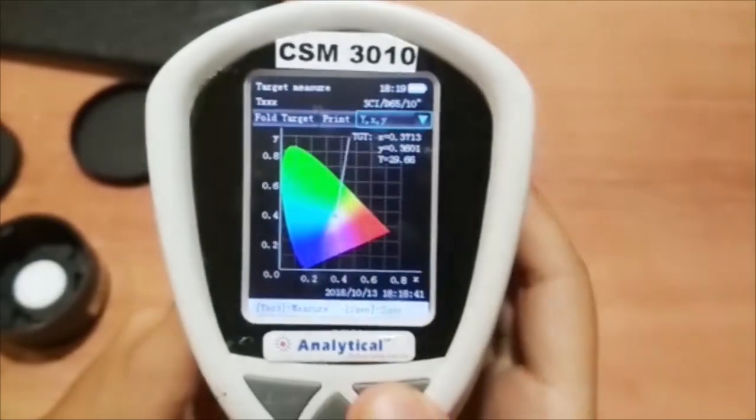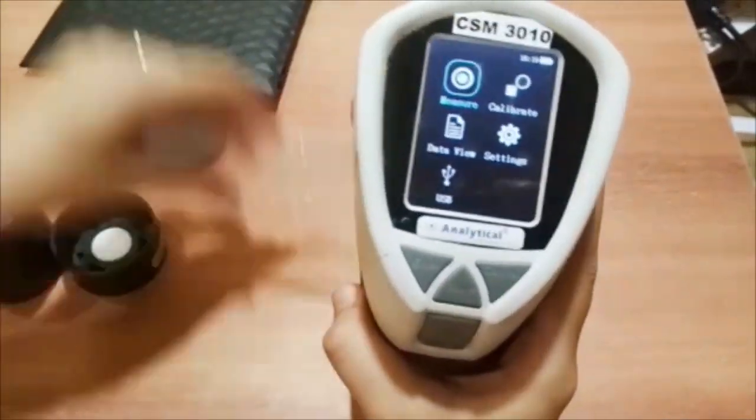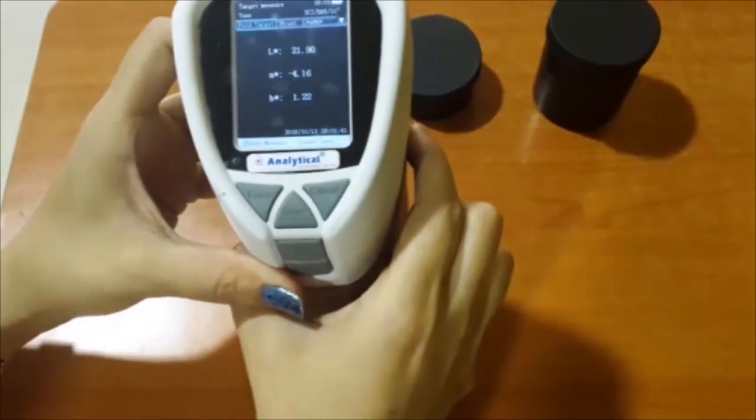Now press the cancel button for testing another sample and then take a piece of pink polythene bag. Repeat the same procedure as we did for the white polythene bag.